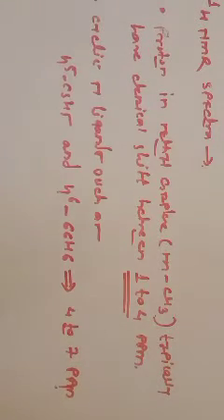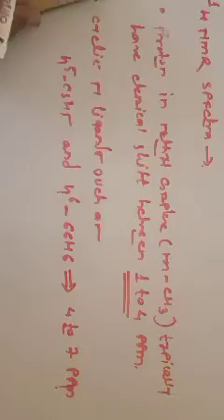Let us discuss the chemical shift values for organometallic complexes in which the proton is directly attached to the metal atom, or is a methylenic proton, or a carbon-carbon double bond proton, or the protons of ferrocene. So let's discuss these values.